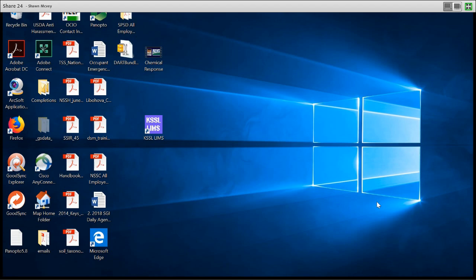You're also going to use it to determine the progress of analysis. That's probably one of the most frequent inquiries you're going to get: what's the progress? So we're going to go over how to evaluate the progress.